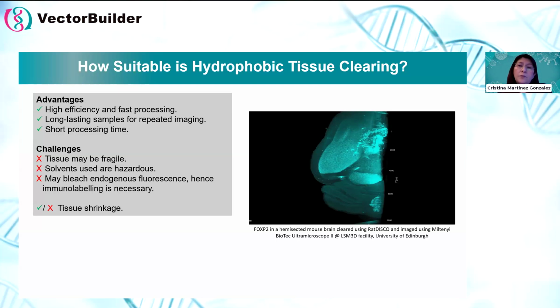But for me, for example, that I work with rats, the rat tissue is huge. The brain of rats, the size of my thumb, is massive. So finding a microscope with enough working distance to put it on there is not that easy. So shrinking the tissue for me is quite an advantage because a smaller tissue means a smaller area to image, smaller data. At the end, I don't end up with terabytes, I end up with gigabytes, and for me it's an advantage. But if you already start in an organoid, perhaps it's not ideal that it shrinks even more.